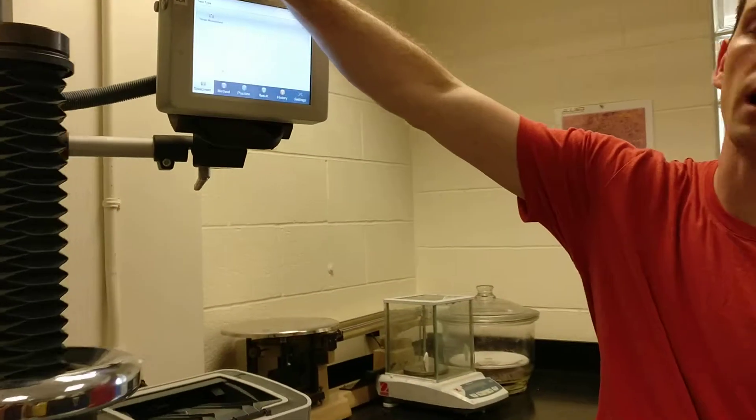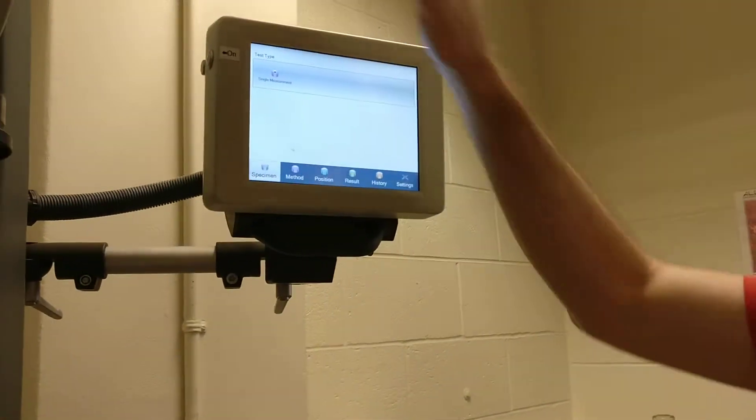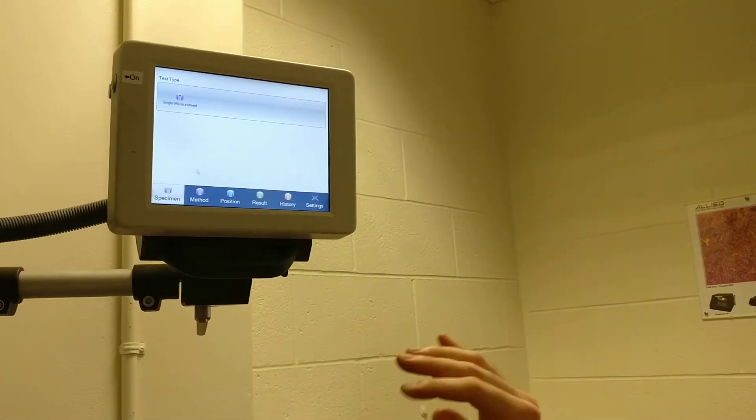To set it up, first you turn it on with the button on the side here, and then when it asks you to log in, you just push log in — there's no password.